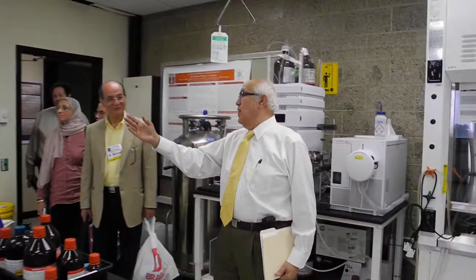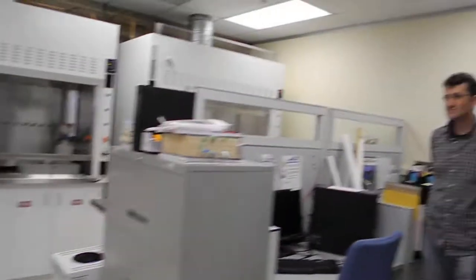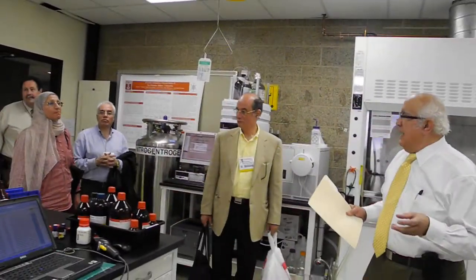This is Vector and this is Roger. We're here in Mulder Center. We have some tests here. And so this lab was established to make some molecules to test in an animal.